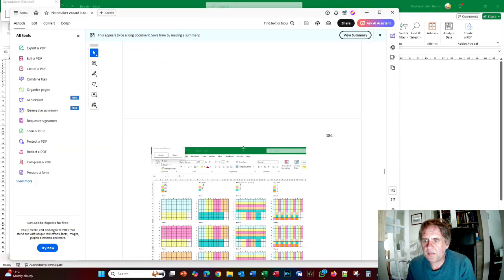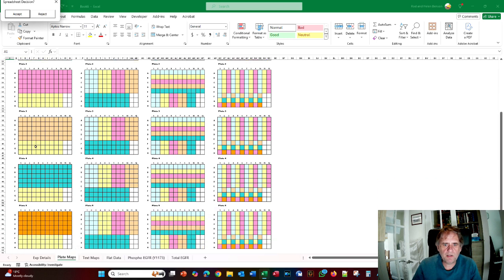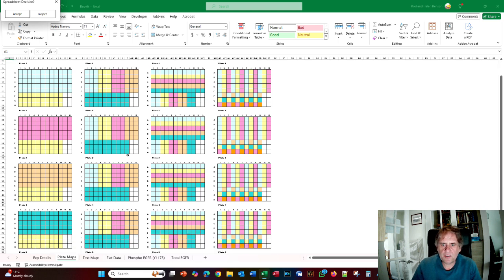You can see that we end up with this lovely plate map here. So this is again the original experiment. So now we have our 5 compounds on 5 different plates with the 5 time points. So these are the time points running downwards here. Repeats are running across in rows. And you can see now that the controls are occupying this bottom part.